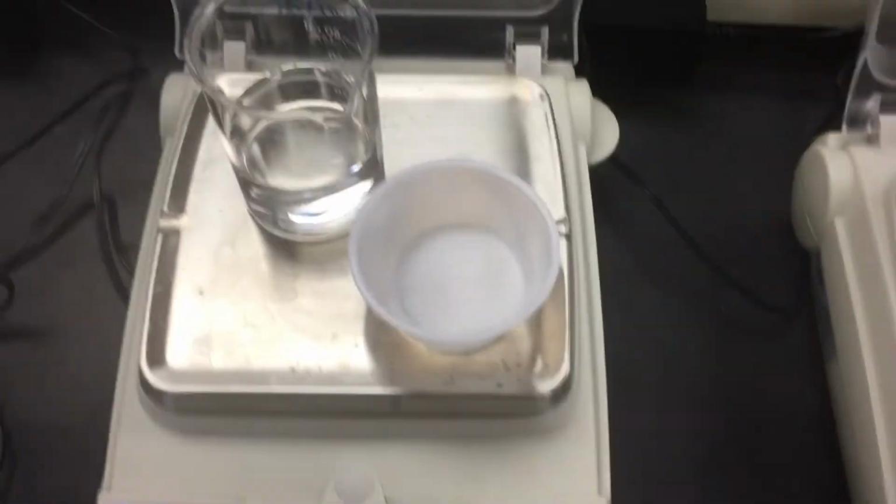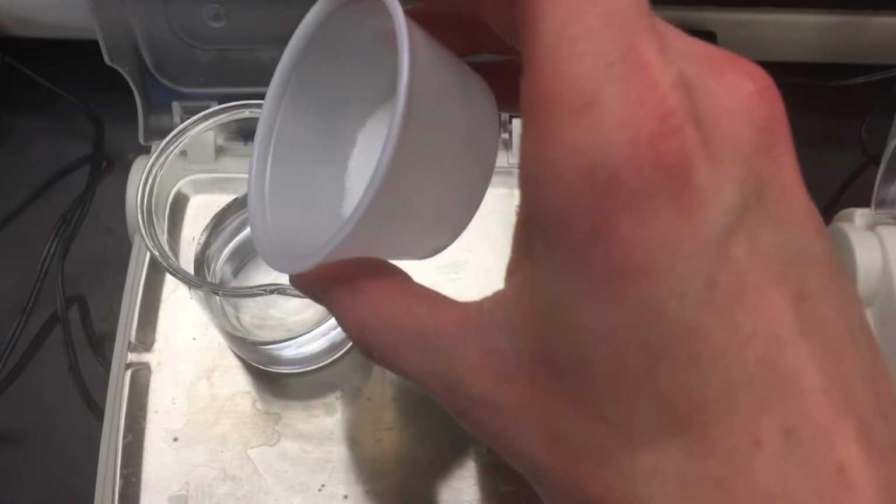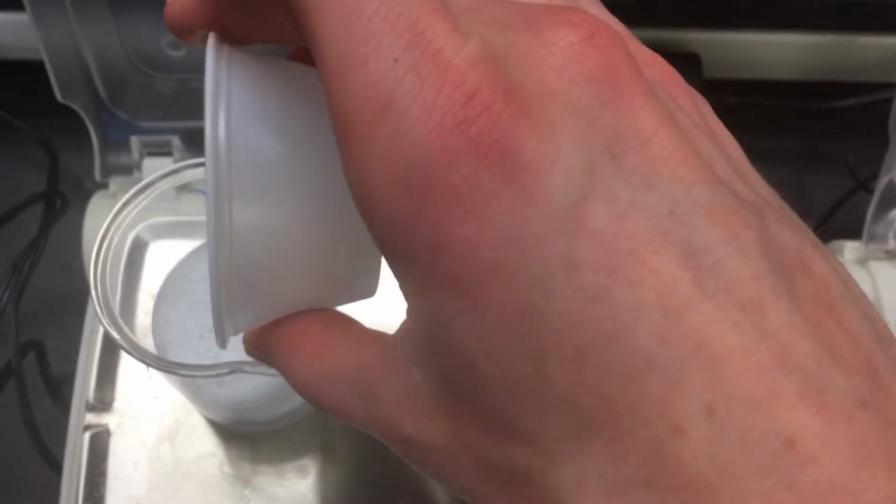Okay, so what I'm going to do now is I'm going to add the sugar to the Sprite, and we're going to see how much the mass decreases. And you can see what it looks like when I add sugar to the Sprite. Notice it fizzes quite a bit.